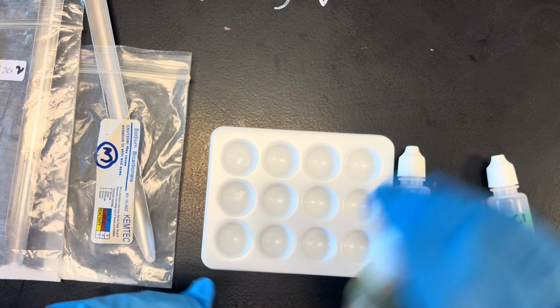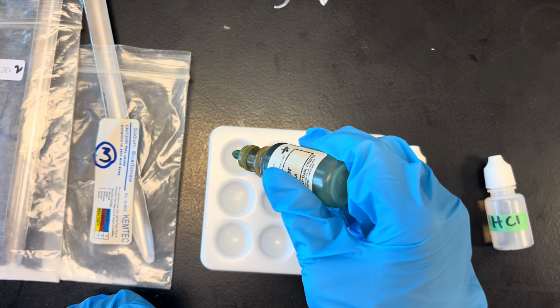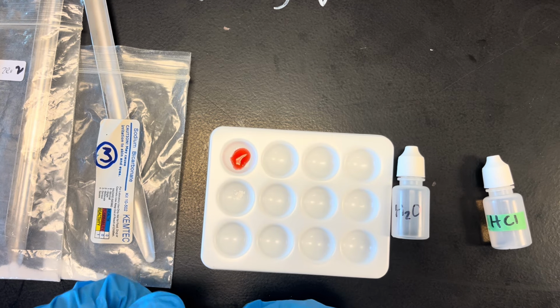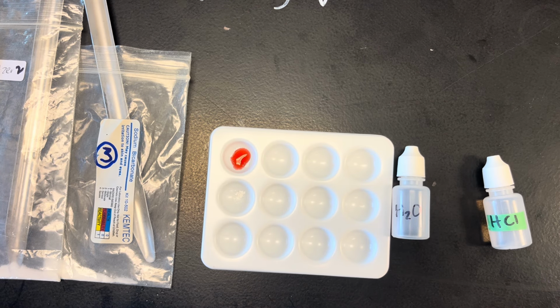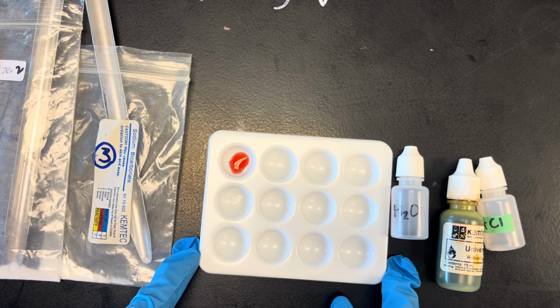Then in the same well, you're going to test it using the universal indicator. You only need 1 or 2 drops of universal indicator. And this time it changed color right away. So I'm going to record that color. If you want, again, you can agitate the tray to make sure it's evenly mixed.